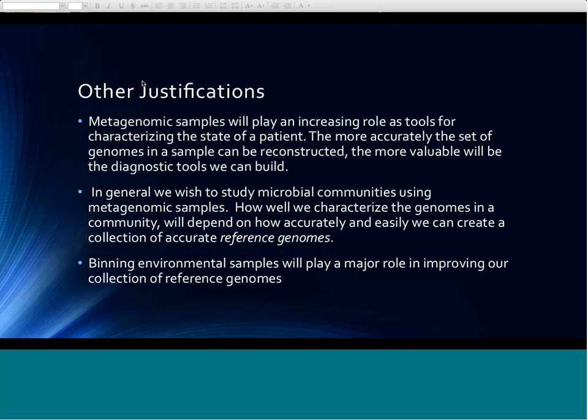Metagenomic samples will play an increasing role as tools for characterizing the state of a patient. Oh, okay. Yes, I'm sorry. There was this fundamental use, and now I'm talking about the use in diagnostics. Besides the fundamental use, one can use reference genomes to create diagnostic tools. The more accurate the set of genomes in a sample that can be reconstructed, the more valuable will be the diagnostic tools we can build.